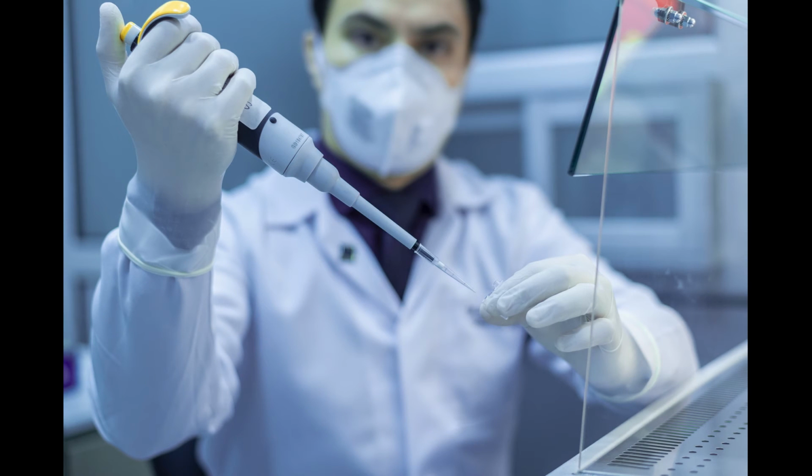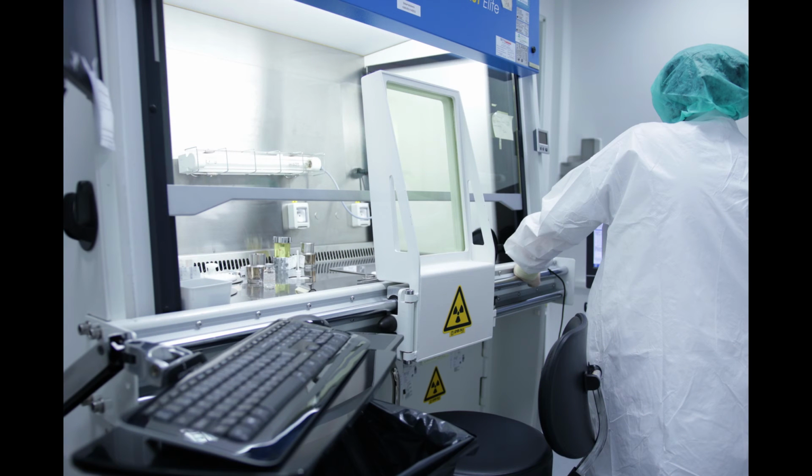Much like a PC2 level facility, air is a consideration, but in this case, exhaust air cannot be recirculated back into the laboratory, and so air must have a continued directional airflow that draws fresh air into the laboratory from clean areas, and in doing so, it avoids bringing air in from potentially contaminated areas. This would prevent the spread of any diseases should they somehow get out of containment. There should be at least 2 doors that allow for an airlock type facility that further facilitates this directionality of air movement.